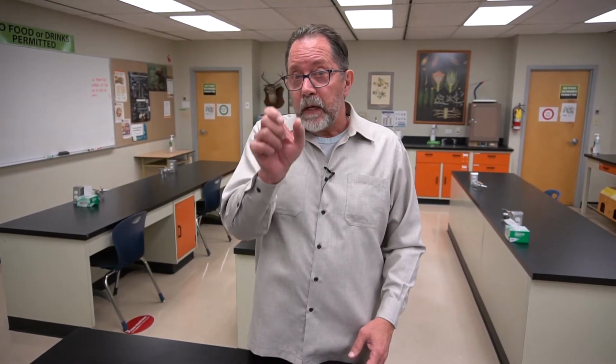And the two things is that as meiosis goes along in this dung fungus, the spores that are created are held together in a structure called an ascus. And in this case, there's going to be 8 spores, and they're all going to be lined up in a little capsule, as I've called it, the ascus.